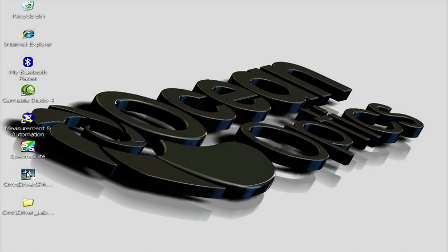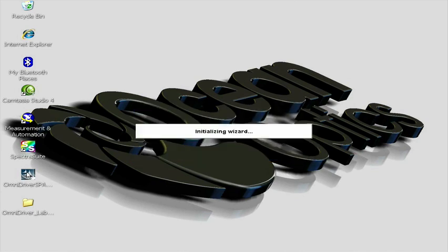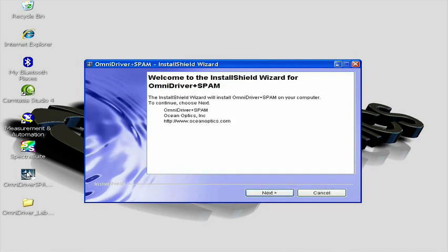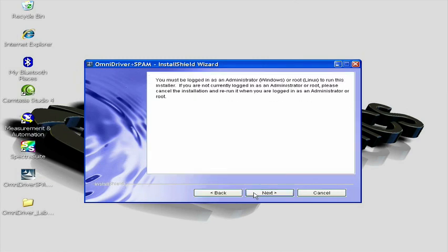This will launch the Install Wizard for Omni Driver. The first screen welcomes you to the Install Shield wizard for Omni Driver plus SPAM. Simply click Next to proceed.